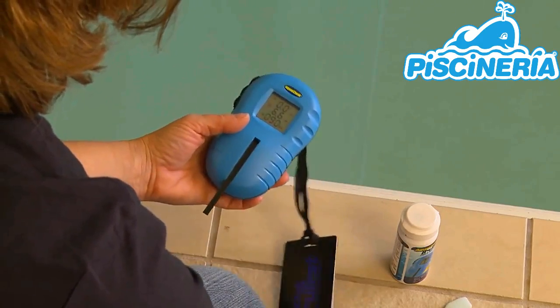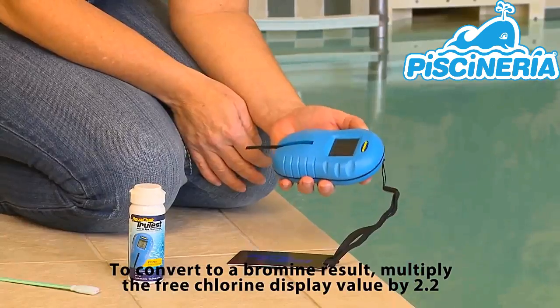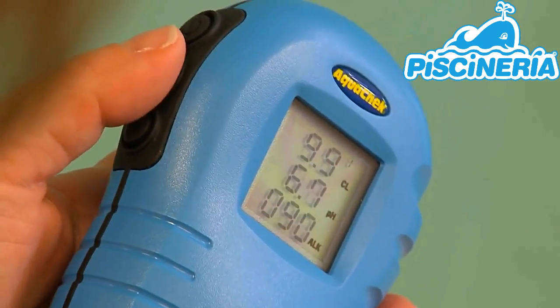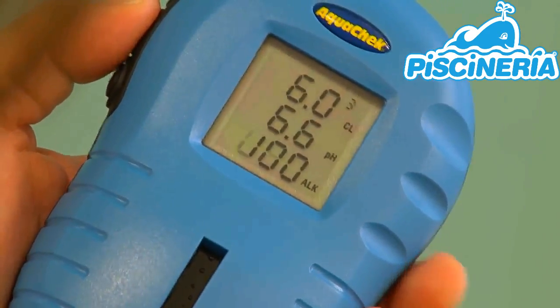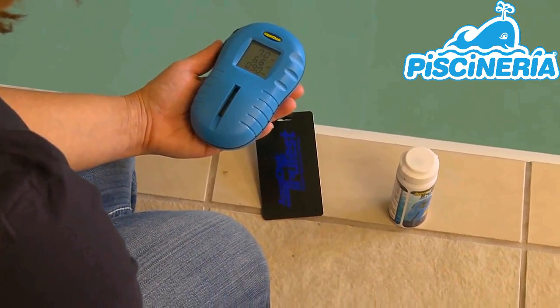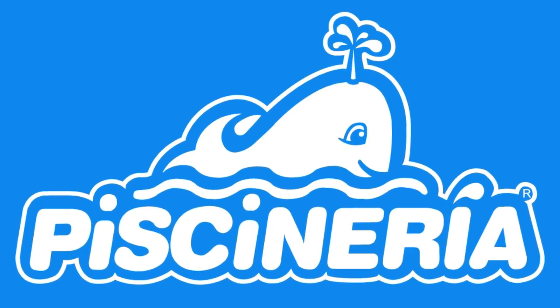Next, results are displayed for free chlorine, pH, and total alkalinity. The reader will store the last 9 results and can be accessed by using the scroll button located on the left side of the reader — it is the middle button. Afterwards, remove the test strip and clean off the test strip window with the cleaning tool or cotton swab.